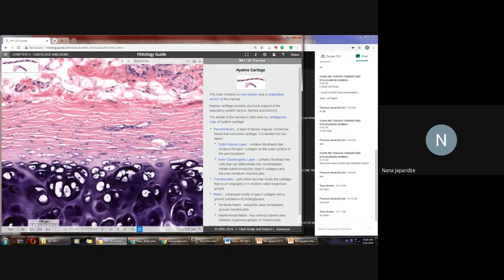Look, you see here a group which contains 3 cells. Here is a much larger number of cells. Here too. So these are dividing cells. They are cells which have the capacity to divide, but the extracellular matrix hampers them. They are not able to move and to allocate separately from each other. That is why they give rise to the groups of cells.